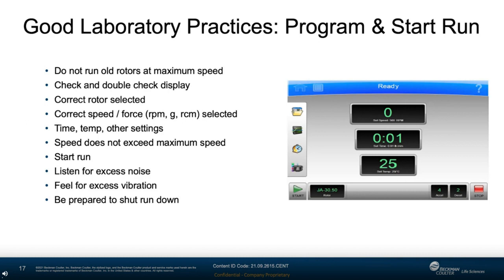Another safety-related practice is to be aware during early rotor acceleration of excessive vibrations, which is a sign of an imbalance. If this happens, stop the run. Centrifuges have imbalance detection features, but at times do not pick up imbalances quick enough to prevent a costly accident.